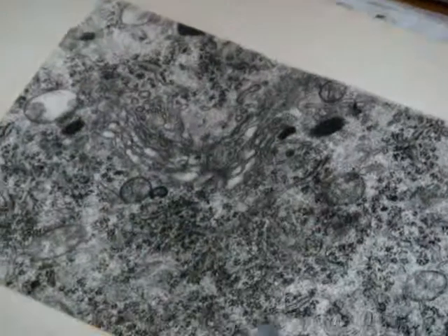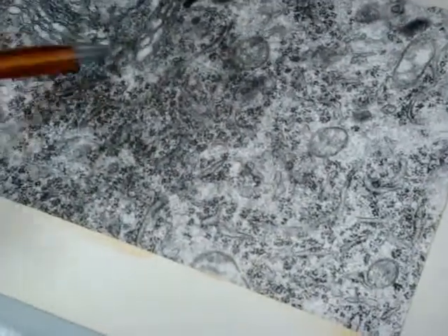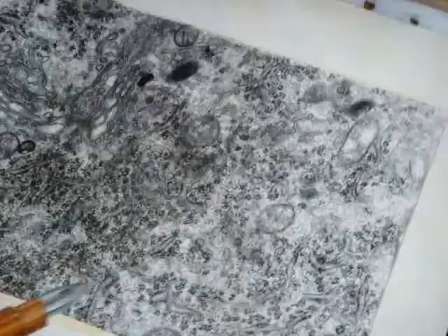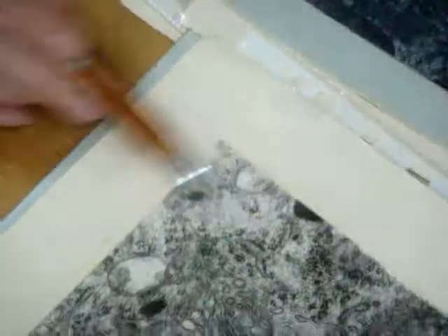Again, part of one cell. And what can we see? We can see free ribosomes and rough endoplasmic reticulum. So complex again. So this is the Nissl body, Golgi apparatus. So what is the tissue? Nervous. This Nissl body can be found either in the cell body or in dendrites. What is this, teacher? These are secretory granules, we know that they secrete something, so this may be acetylcholine. This is destroyed mitochondria. They are very sensitive to changing pH, and during preparation they can be destroyed.